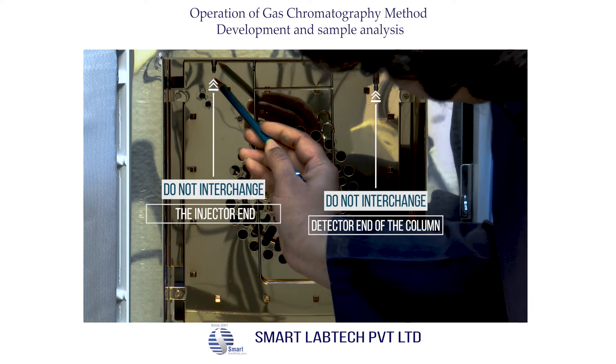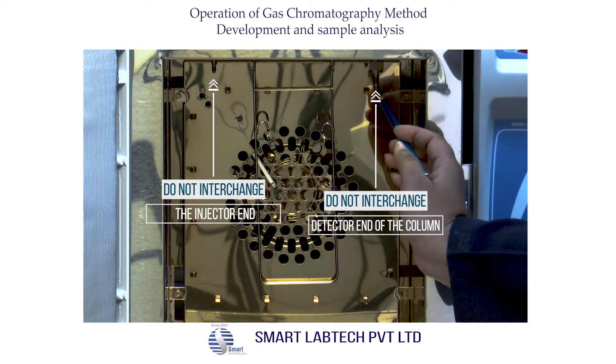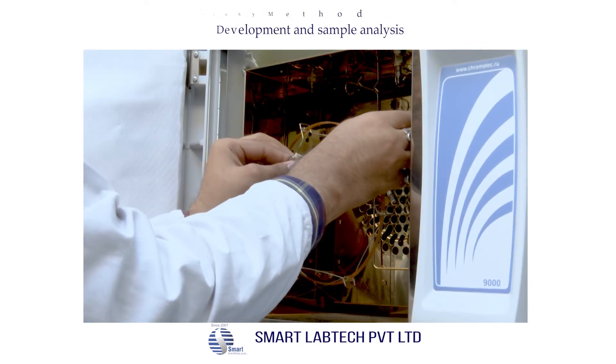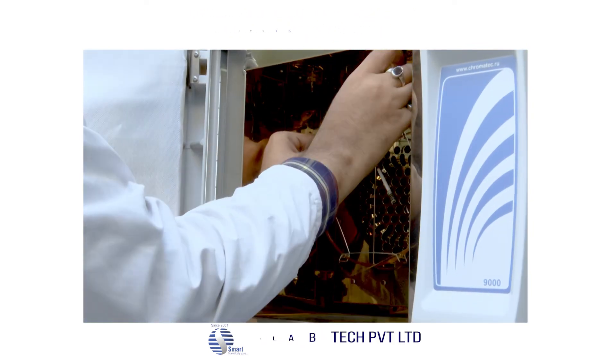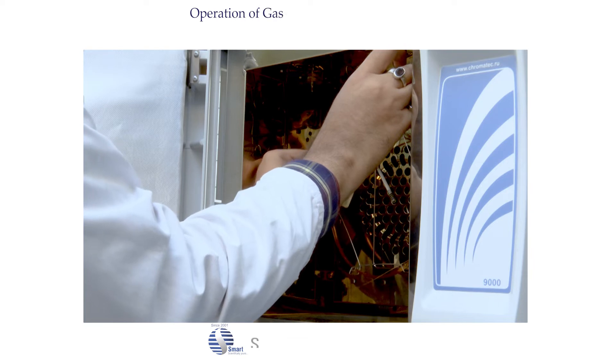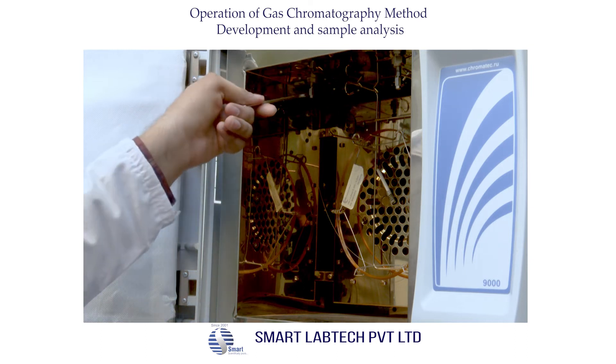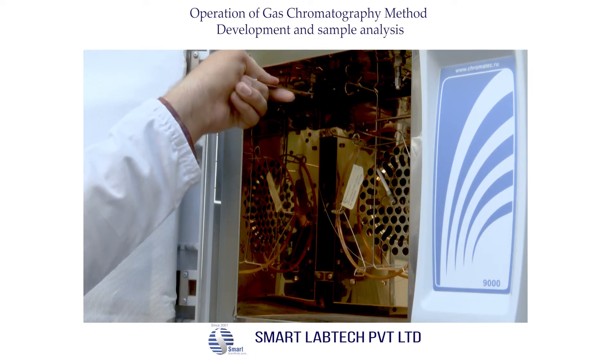Do not interchange the injector end or the detector end of the column. These are the two ends of the column. Now we are fixing the column — take care that the column should not touch the surface of the oven. Tighten the nuts at the injector end and the detector end.